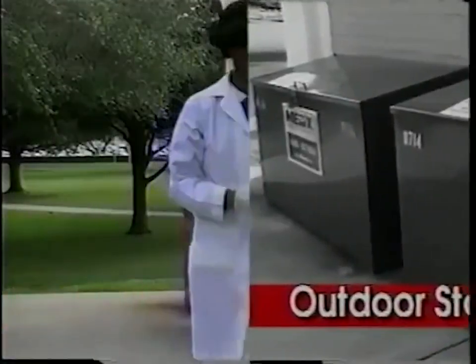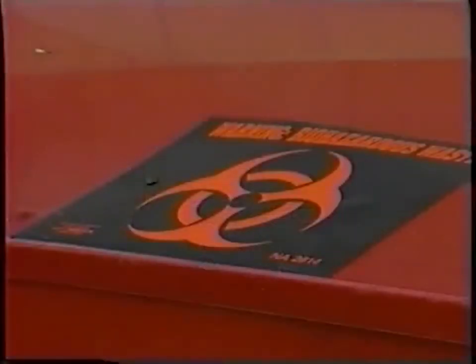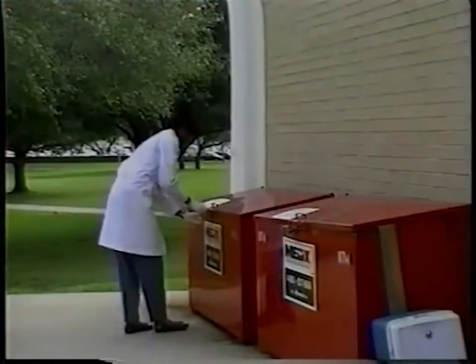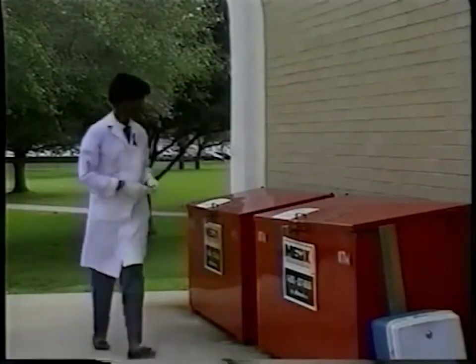Outdoor storage areas and containers are to be conspicuously marked with the International Biological Hazard symbol and must be secured against vandalism and unauthorized entry. Because an outdoor storage area is more easily accessible to the general public as opposed to indoor storage areas, the presence of the symbol and security mechanism are required.